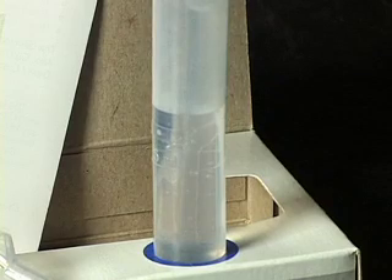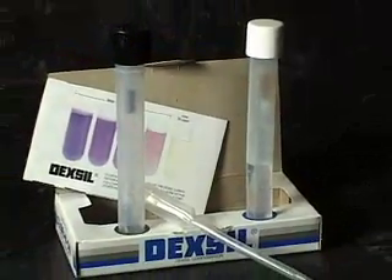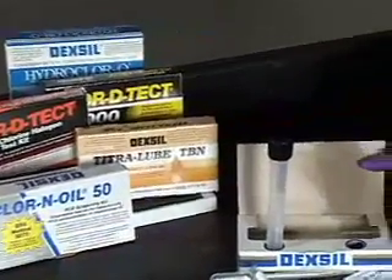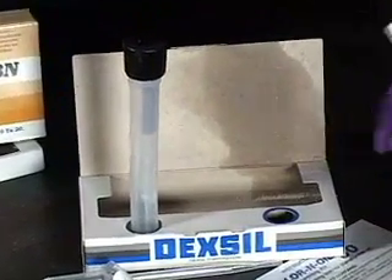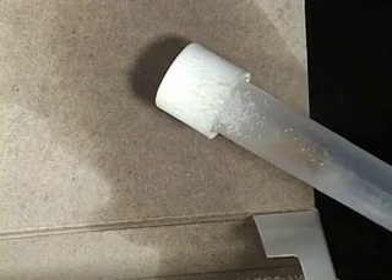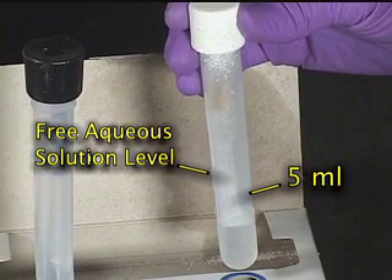Before a test is run, it is important to check the entire contents of the kit. Make sure all the components are in the box, all the ampoules are intact, and observe the following as a check for leaking buffer solution. Inspect the boxes for evidence of moisture damage. Look for salt crystal residue on the kit boxes and around the cap of the tube. Check the level of the liquid in the tube. The free aqueous solution should be approximately 1.5 inches above the 5 milliliter line embossed on the tube.